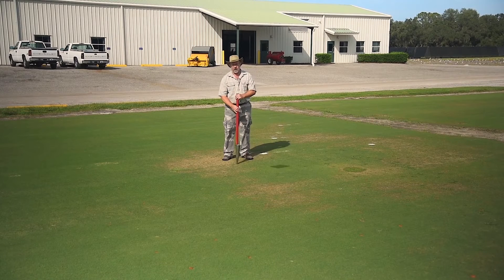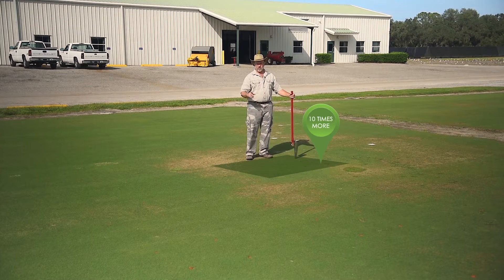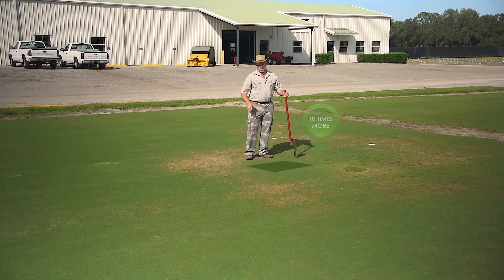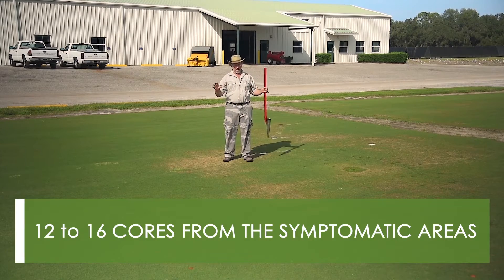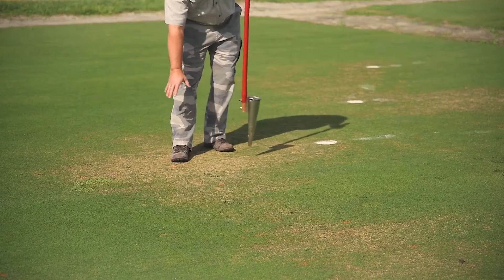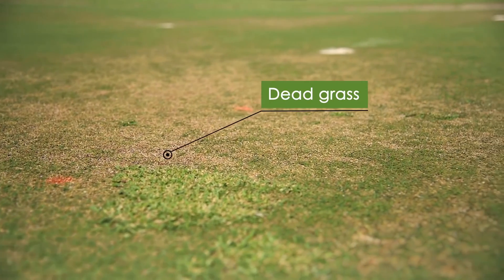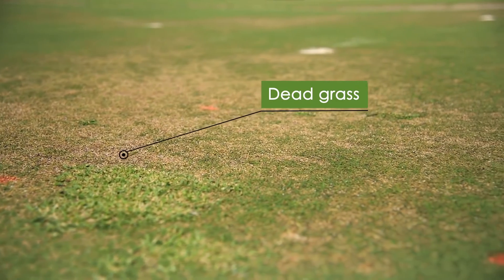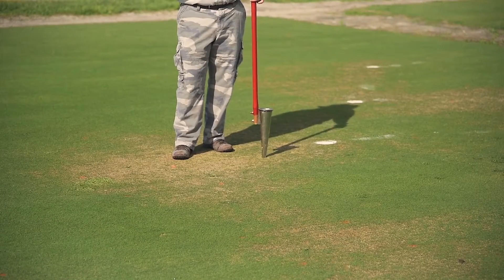If I take a core right here and a second core here, I can have ten times more or fewer nematodes in one core than in the other. So I want to take between 12 to 16 cores from these symptomatic areas. Now if you see where the grass is dead, I don't want to take my cores there because the grass is already dead — there's nothing for the nematodes to eat. So we want to concentrate our sampling in areas where the grass is sick but not dead.